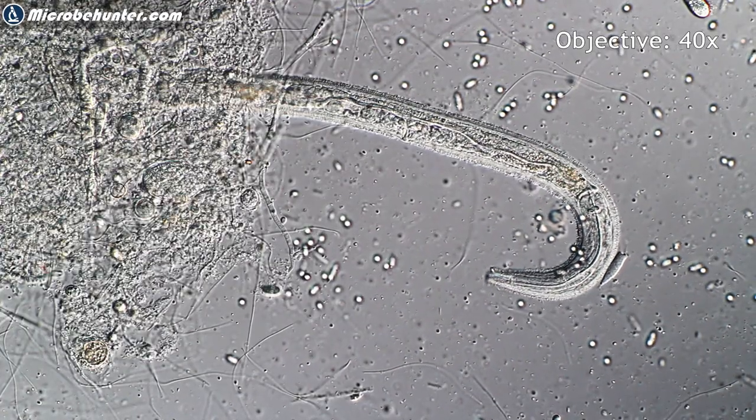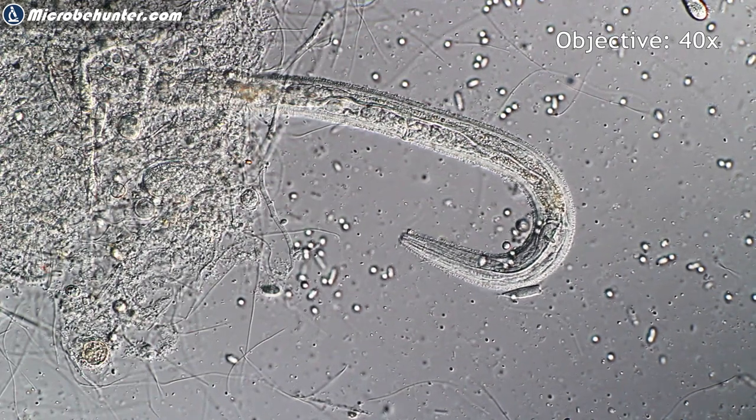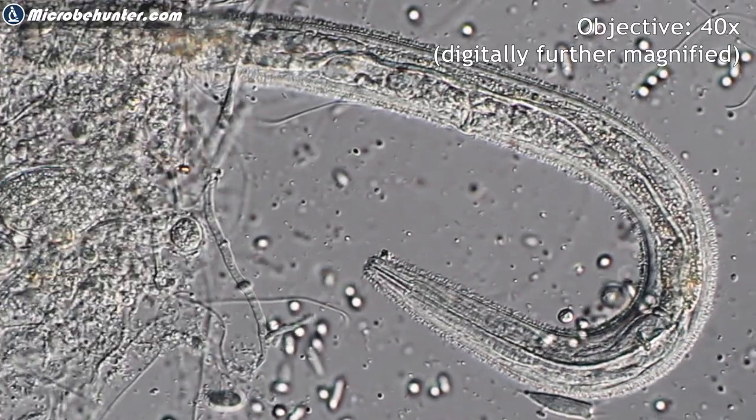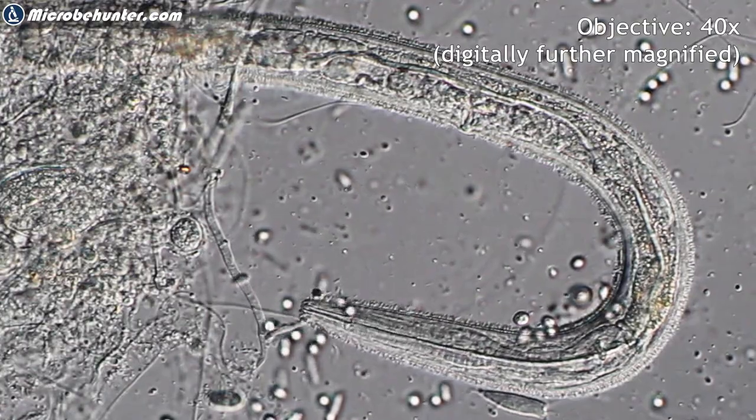So what I usually include in the corner is I'm simply telling them what objective I'm using, like the 10 times objective or the 40 times objective to make a certain image. But this does not mean that the final image is now 10 times or 40 times magnified. I'm just indicating this way that this is the objective that I'm using because there's so many other factors that are involved here.